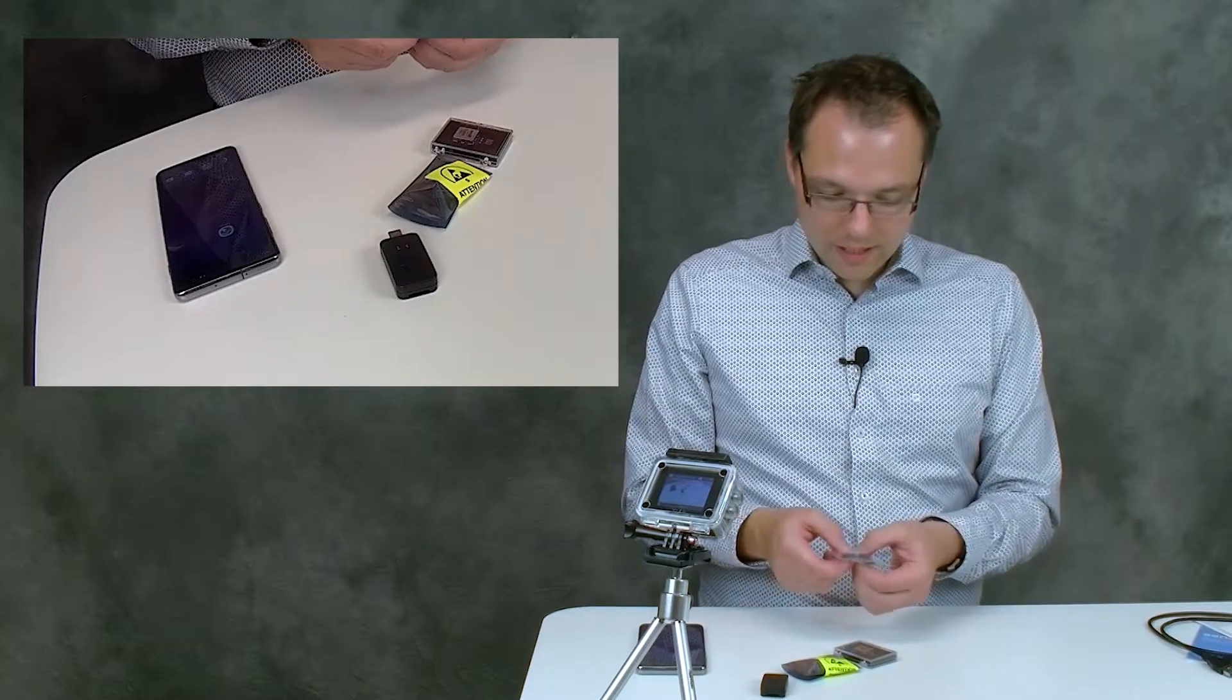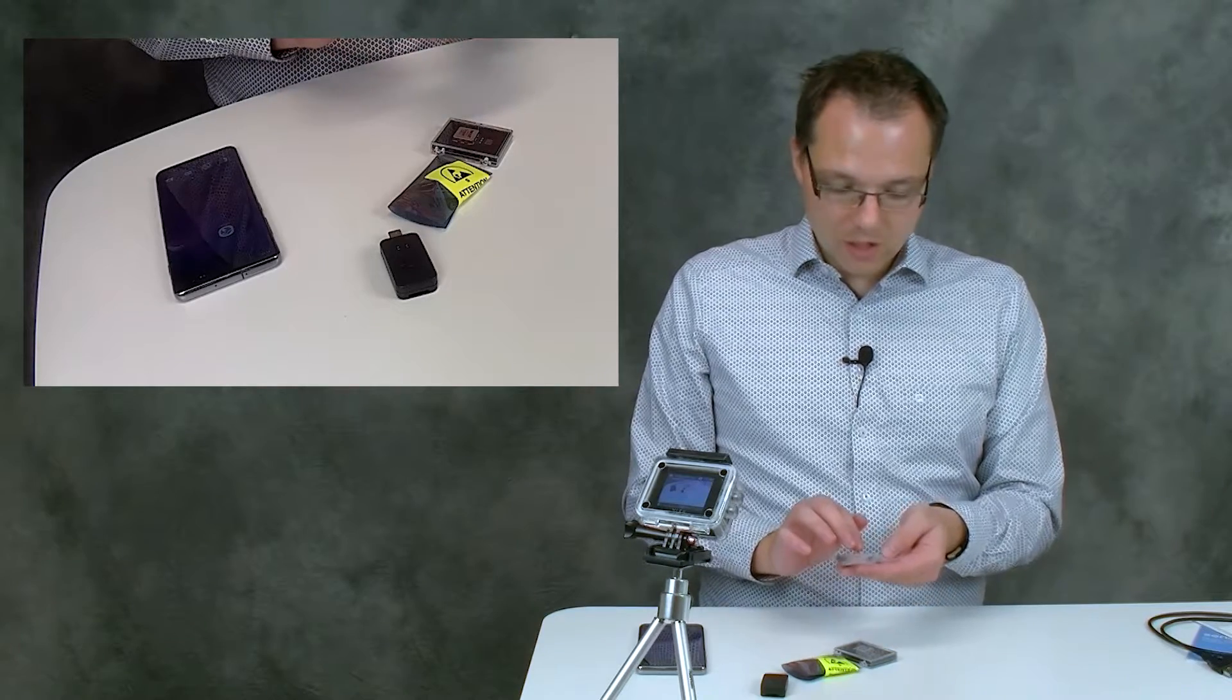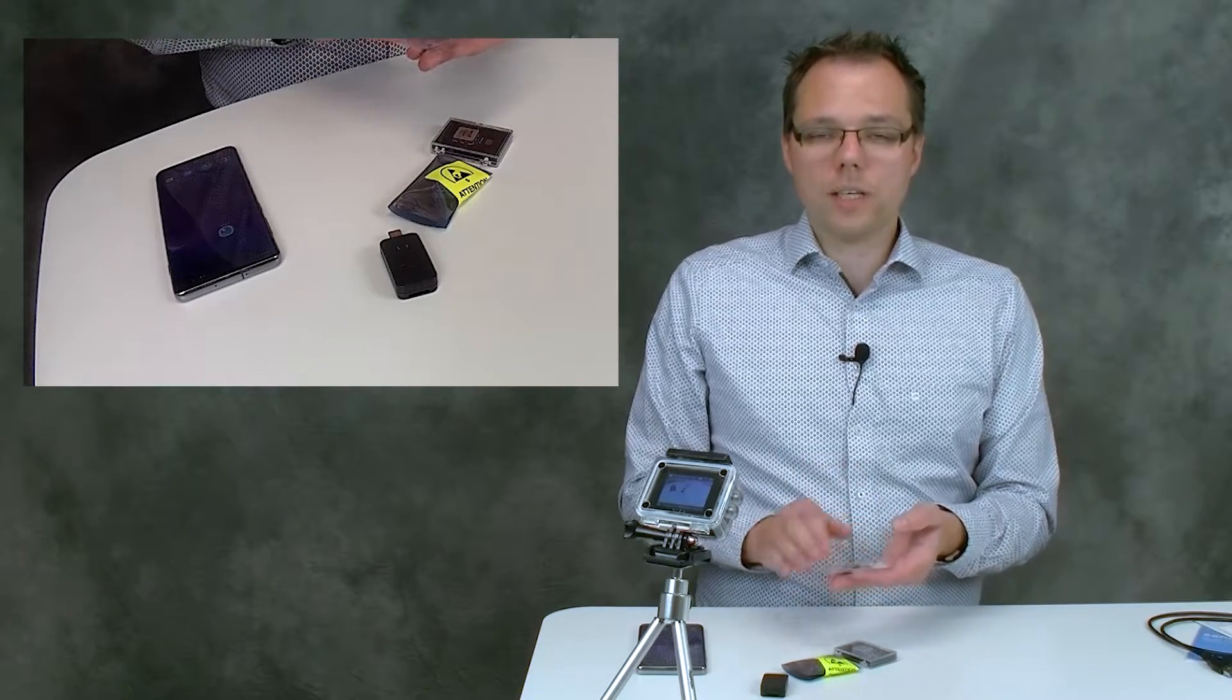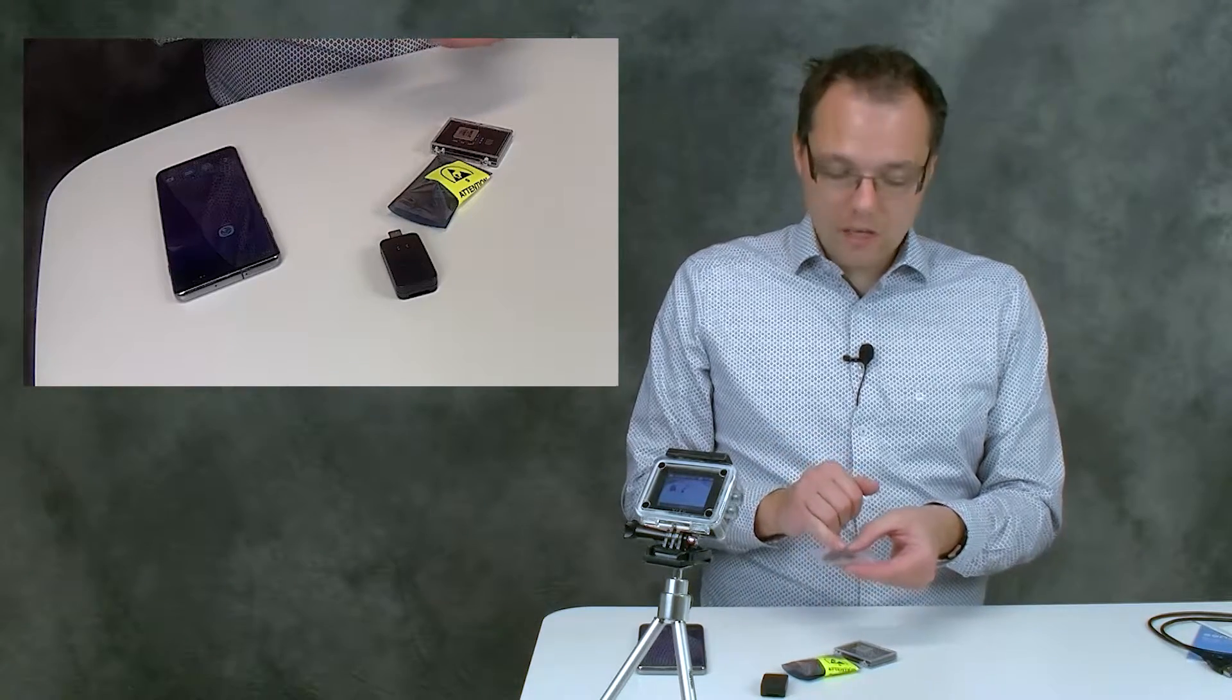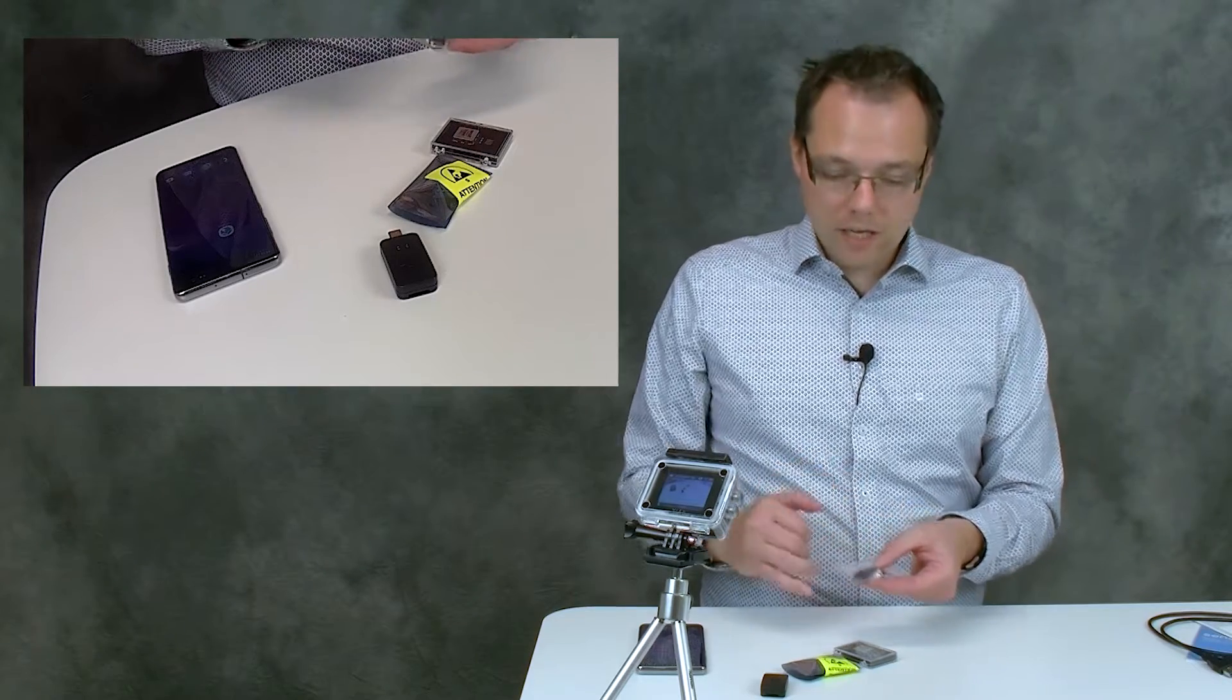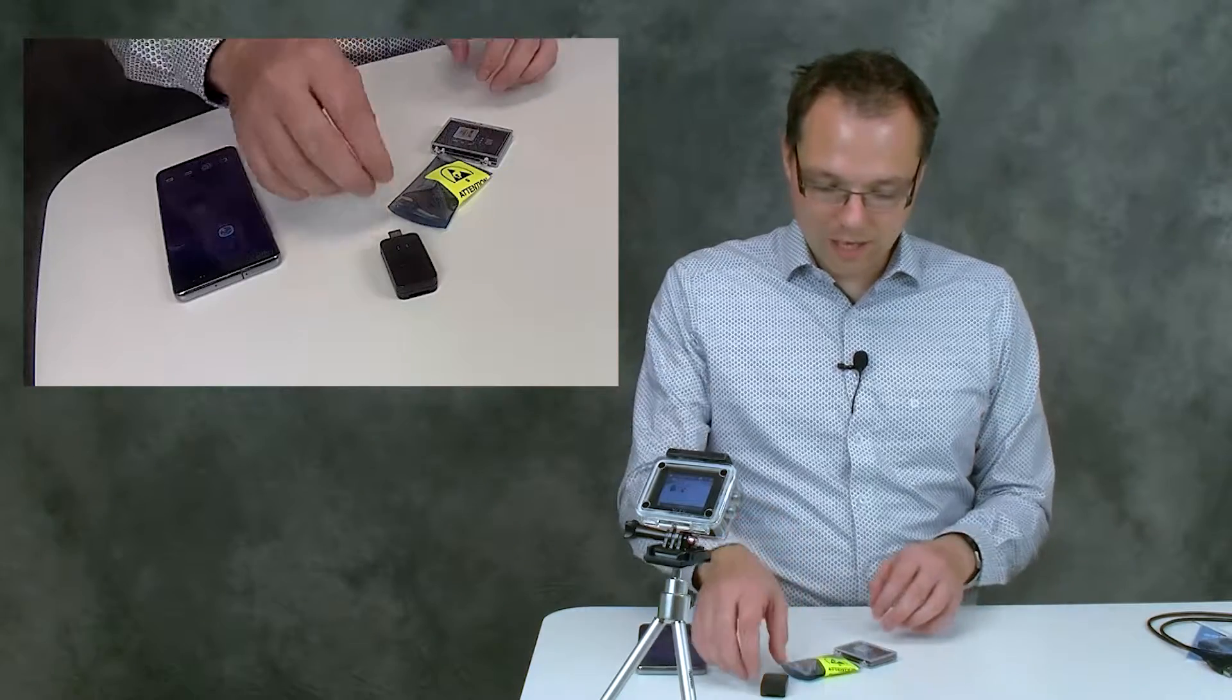Furthermore, in here is an adapter for micro USB. There are still a lot of phones and tablets around that have a micro USB, so don't worry, you can also use the Sensit Smart with that. And a port protector that is just a device that has a male USB-C on one side and a female USB-C on the other side, just to reduce the amount of times that you plug and unplug your device.